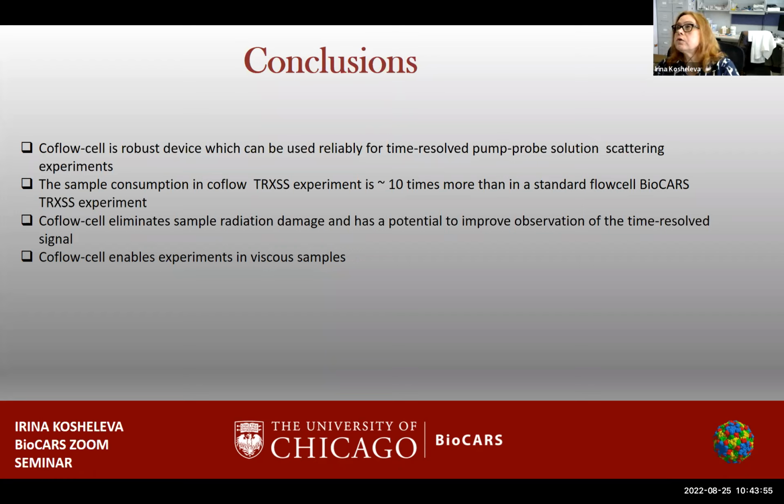And the laser beam was much larger than the X-ray beam. The X-ray beam is a standard X-ray beam, like 35 micrometers full width half max, and the laser is 120. So I obviously didn't have much problem with the overlap, as the data shows.